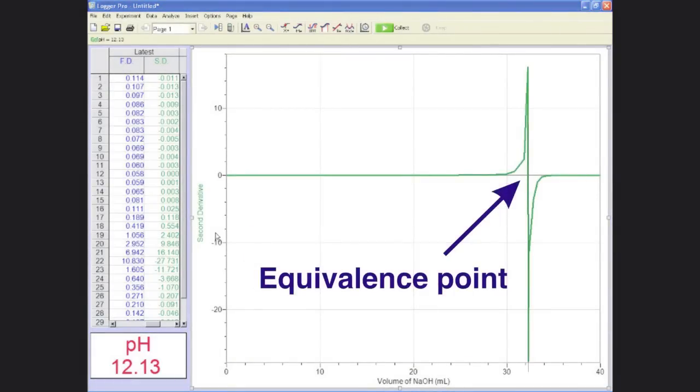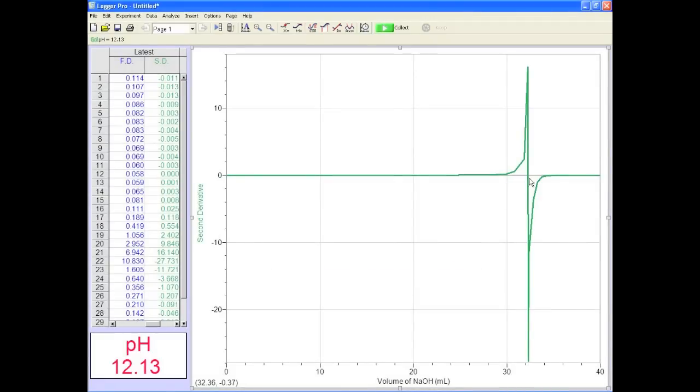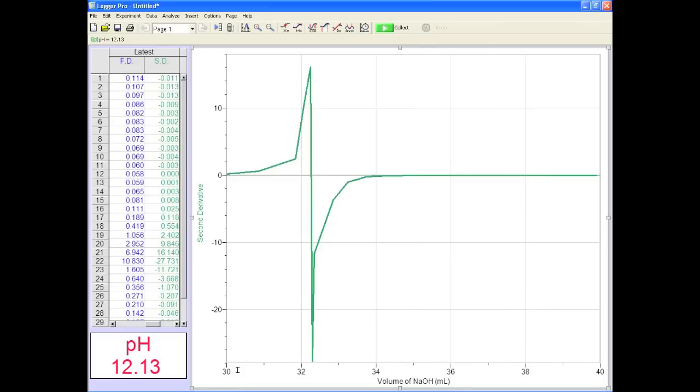The equivalence point volume is where the line crosses the x axis. Zoom up for a better view by changing the scale on the x axis. Record the equivalence point volume, print your graphs and you're done.